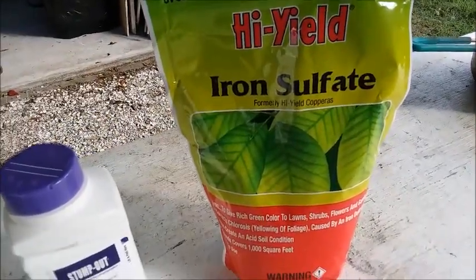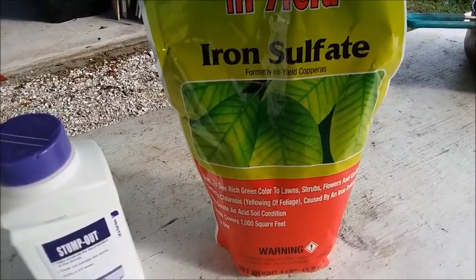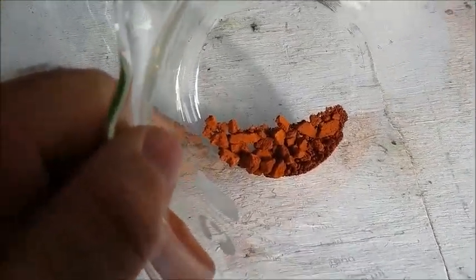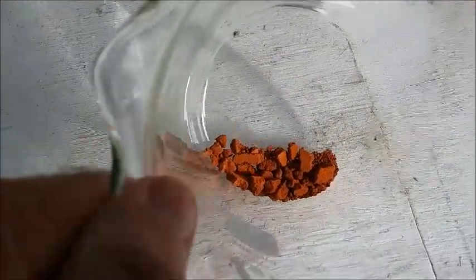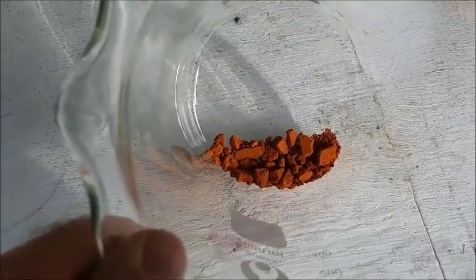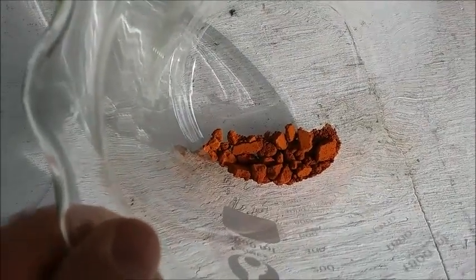I'd never used it before so I had to do a little research about how much to use and how to mix it up. It worked great — it worked absolutely beautifully. This is some really good-looking gold. What I'm going to do is weigh it up, melt it down, and make a button or a small ingot out of it, and we'll see what the jewelry store says when I take it in this time.